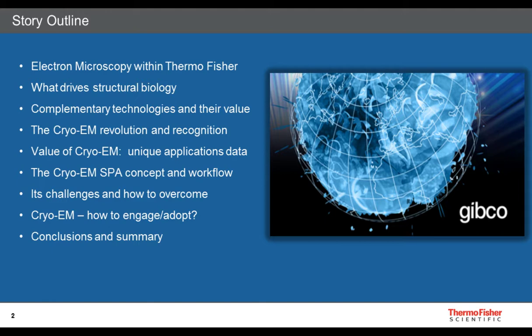I will spend some special attention on the latest, let's say, last couple of years revolution that Cryo-EM has undergone, and the recognition that the technology has actually obtained. I will show some unique applications data where Cryo-EM has made a difference. I will also talk a little bit about the unique single particle workflow concept that Thermo Fisher has developed, and also the challenges that come along with this workflow.